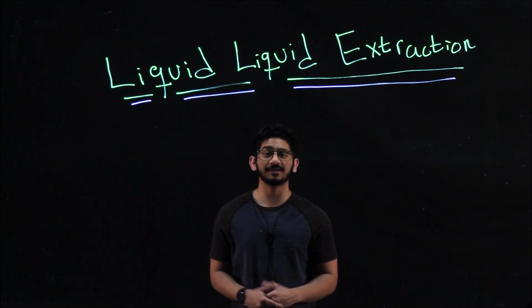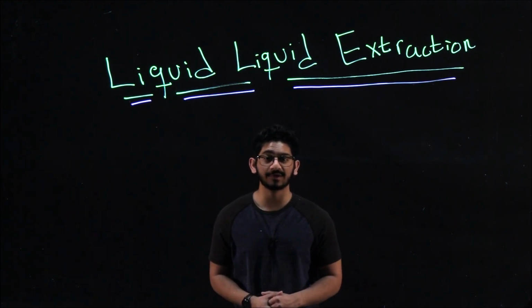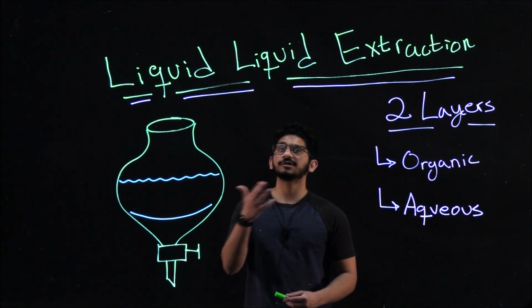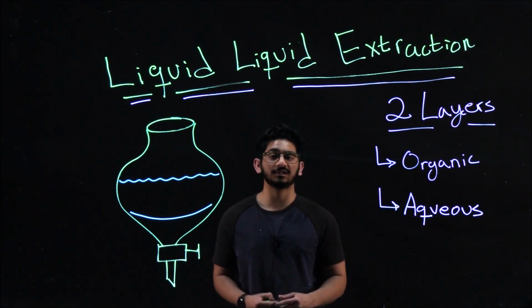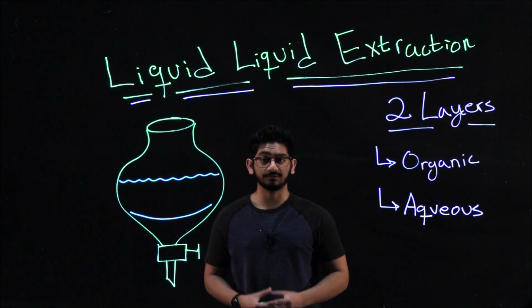My name is Akil Hamseth, and today we'll be covering liquid-liquid extraction, which is a commonly used separation method utilizing a compound's polarities and relative solubility. So the premise of a liquid-liquid extraction is first there are two immiscible layers. One, which is usually an aqueous layer, which is a water layer that's very polar, and two, which is an organic layer that's generally non-polar.